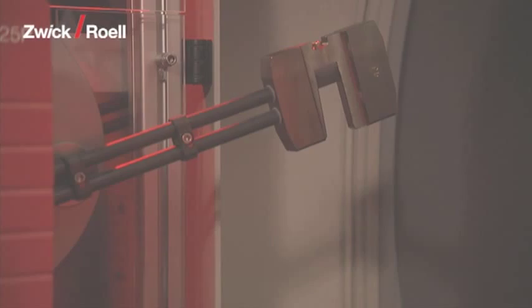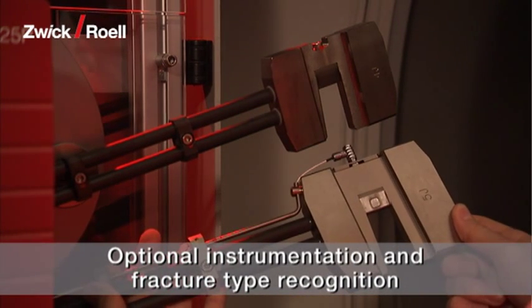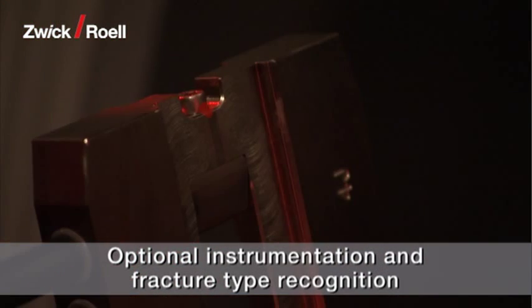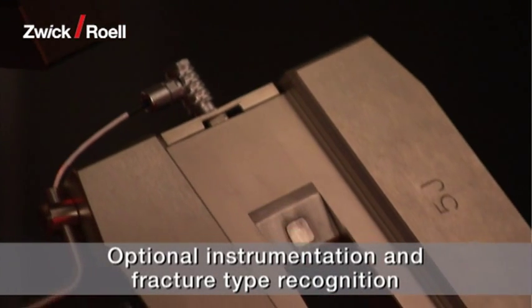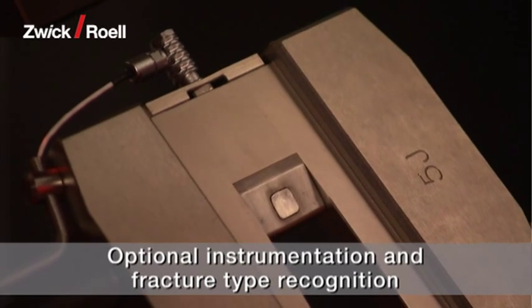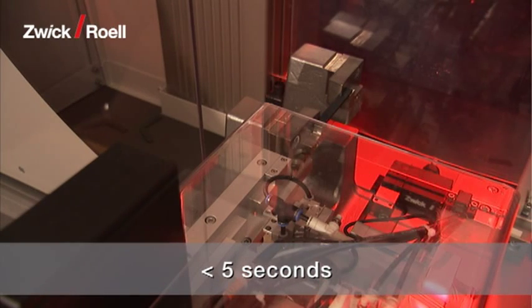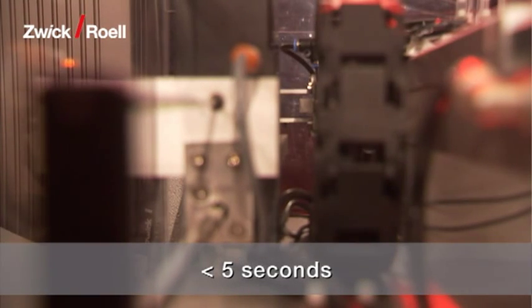The pendulum tup can be optionally instrumented, allowing a force signal to be recorded during the impact test. Also available for the instrumented pendulum is automatic fracture type recognition: full fracture, hinged fracture, partial fracture, or no fracture. The specimen gripper ensures secure, reliable transport of the specimen to the pendulum impact tester support within five seconds.